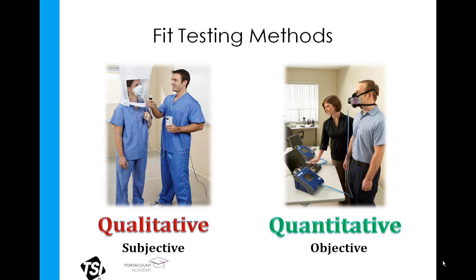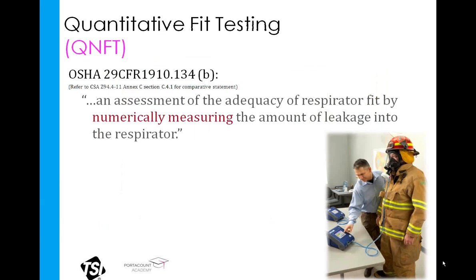Now, qualitative fit testing consists of waiting for a response from the person being fit tested as to whether or not the mask fits. Often they're going to be responding to the tastes of Bitrex, which is a very bitter formula, or saccharin, a very sweet formula. And again, this would be a subjective test because we're waiting for a response.